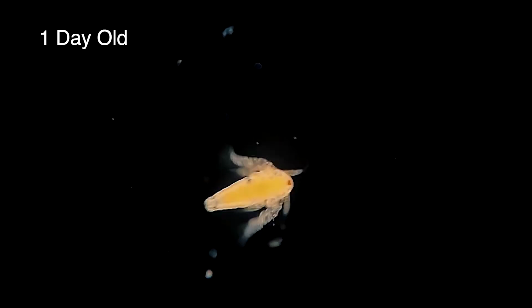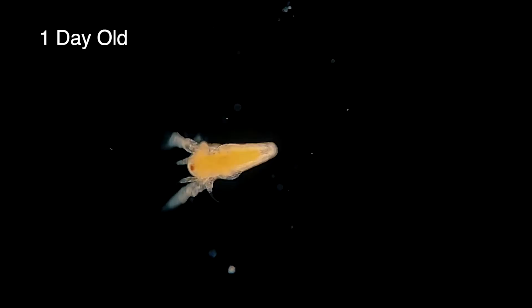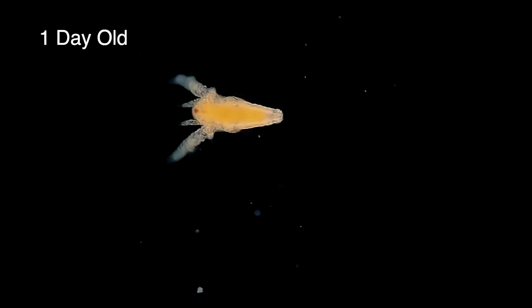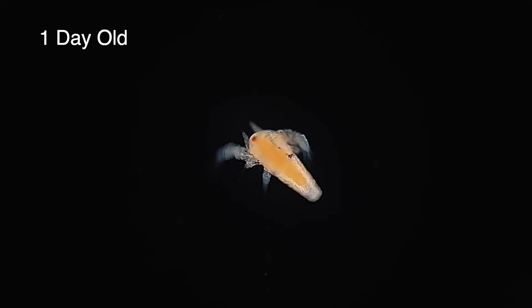This is a newly born baby. They're exceptionally small at this stage and are quite hard to see. The orange color you see in its body is a yolk-like substance in the sea monkey's gut. Because they don't feed for their first few days of life, this orange yolk will sustain them until they can start eating food from their environment. And that red dot in the middle of its head is its median eye — this is the only one they're born with, but make sure to watch it closely as they'll soon start developing a set of compound eyes on the sides of their head too.